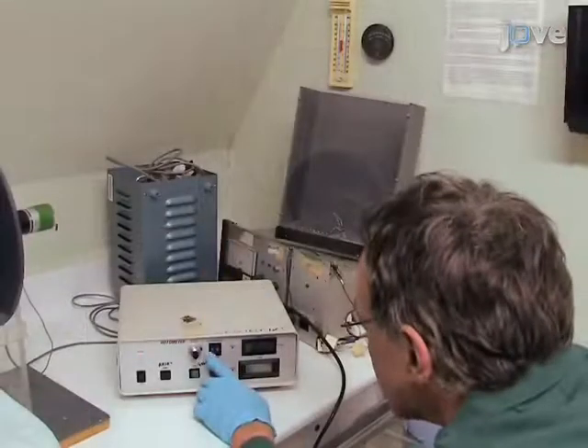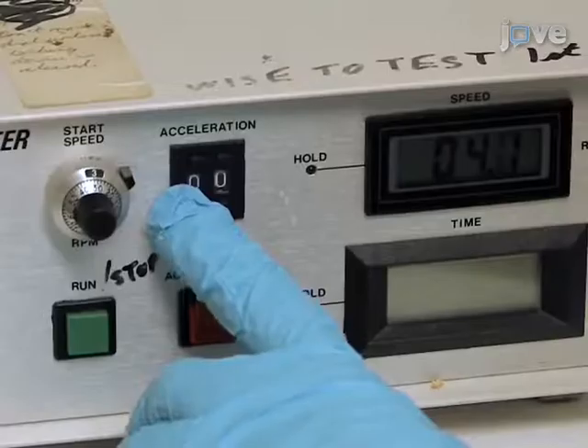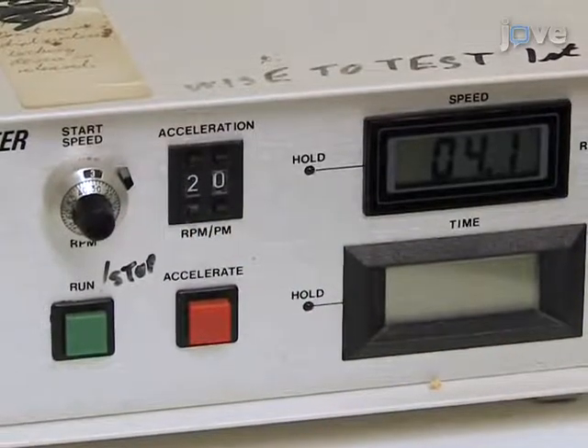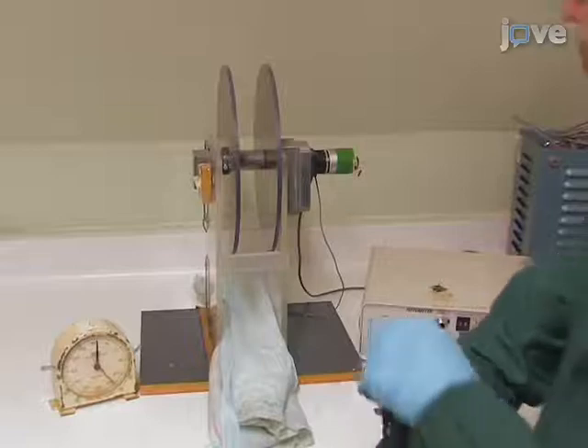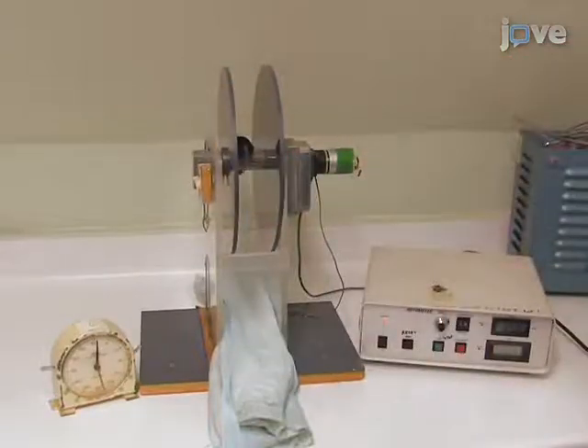Before beginning the trial, prepare the rotor rod by setting a start speed of 4 rotations per minute and an acceleration rate of 20 rotations per minute. To begin, hold the mouse by the tail and bring it up towards the rod at a 45 degree angle below the horizontal.